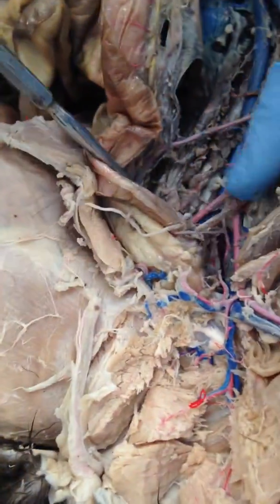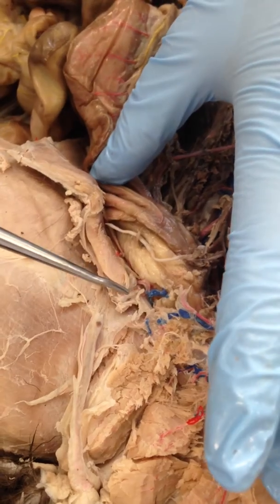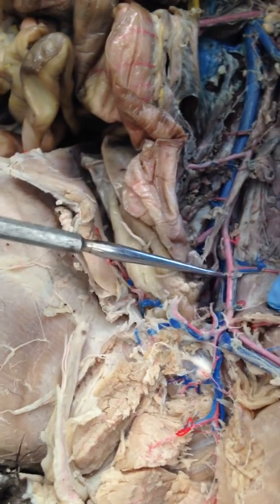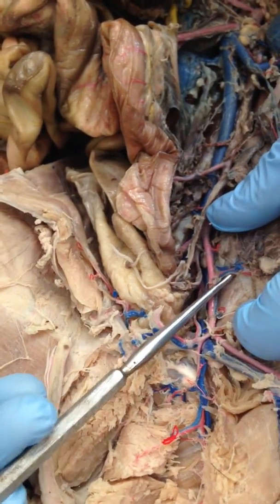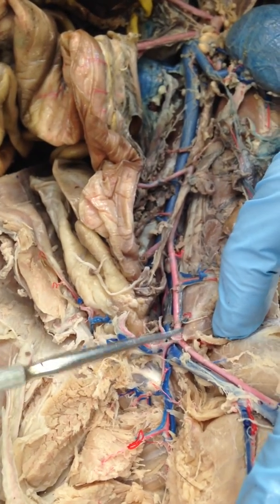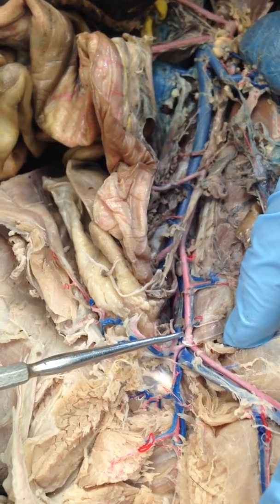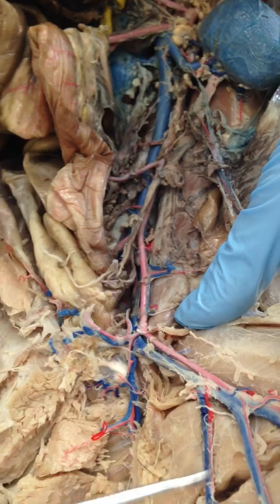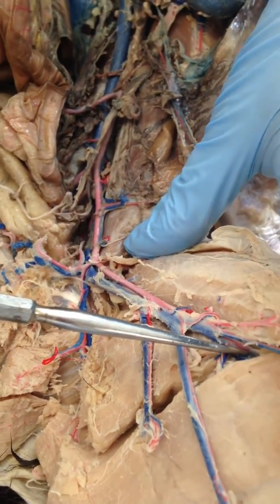And then the next one that branches off is the external iliac. This one right here. Correct? Yep. I don't think we need to know this one. No. And then when it branches here, you've got the femoral and the deep femoral. So this is the femoral. Is this the deep femoral, or is that one the deep femoral? Deep femoral is farther.